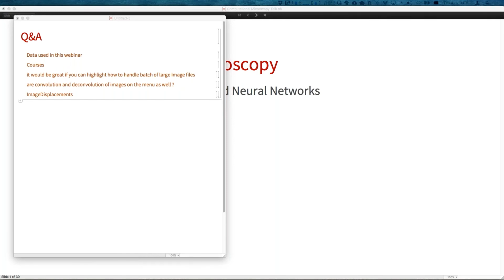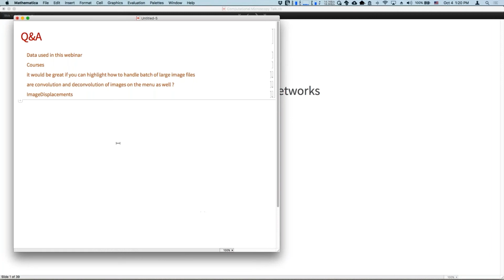I hope everyone has enjoyed the examples that we have shown. As I said to a few of the questions, this was basically a collection of a few examples to give you a sense of what can be done with the Wolfram Language, and we hope you get good ideas for how you can tackle your problems using all of the capabilities we're providing.